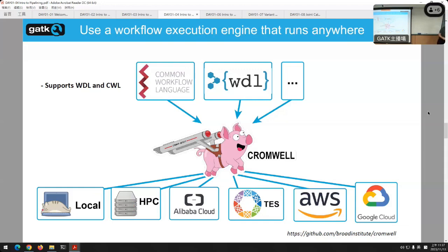So I will note, though, that if you're writing a new pipeline, you do have to make sure that the actual code that you're writing is also compatible with different backends. So it's possible with these platforms to have this kind of interoperability, but it has to be present at every step of the pipelining process in order for it to work.